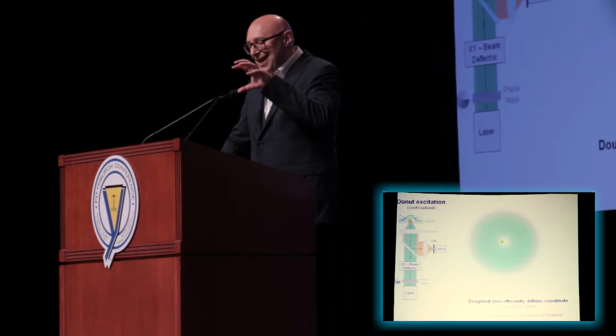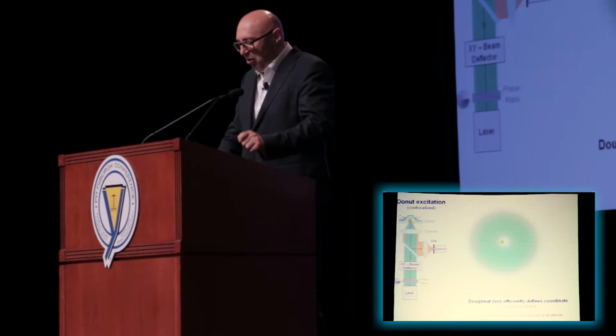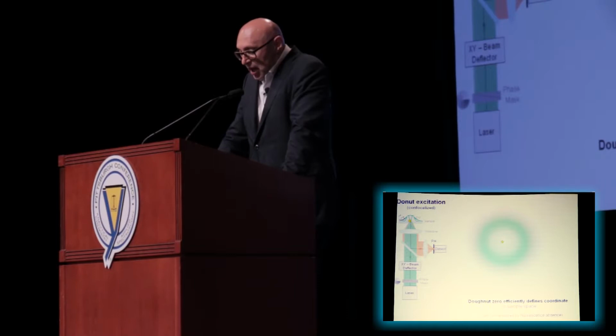If you are worried for some reason that that doesn't make any sense because you don't get any signal if something is in the center and you have to wait for ages to get something, that's not the case, because we can crank up, so to speak, the power of the donut. It will not bleach our molecule because the molecule still is in the region where intensity is very weak, and so it won't be bleached. We just get signal. So there's a way of controlling the signal and the measuring time without bleaching the molecule. And now I'm going to explain to you the basic idea behind this localization scheme.